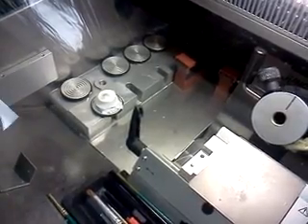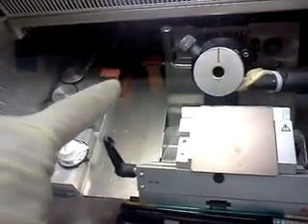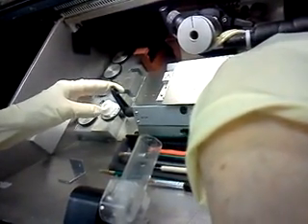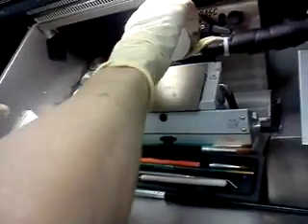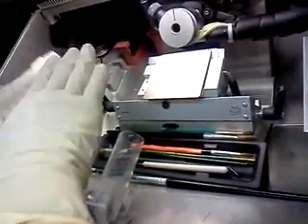Now you'll notice that it's got a slant. Well, that's because when it was cut, this thing isn't straight up and down. It's laid back. Now this can be oriented, and that manual will tell you how. You see, this lever can be moved, this lever can be moved, that lever can be moved. You can make this go this way, that way. You can move things so that the orientation is however you want.